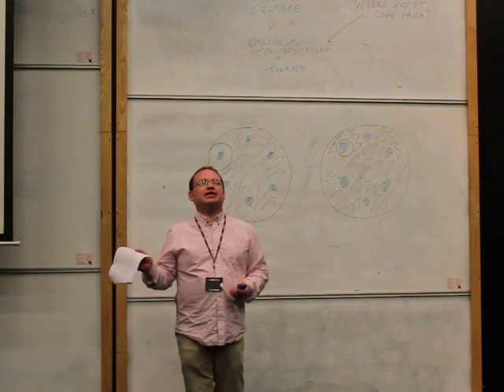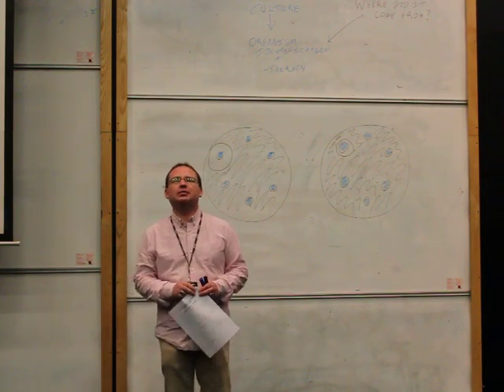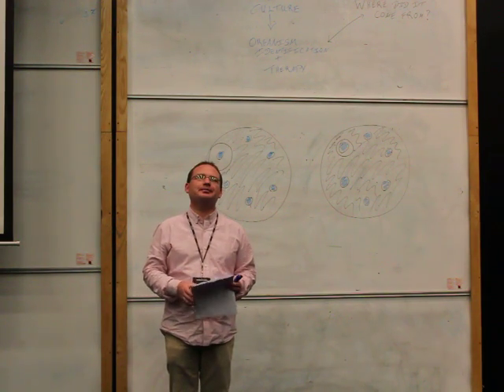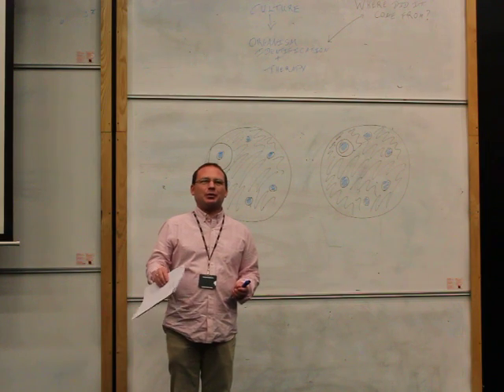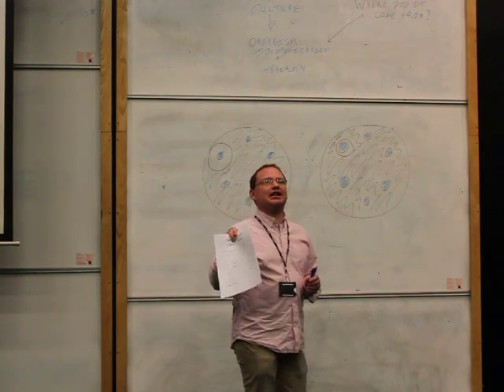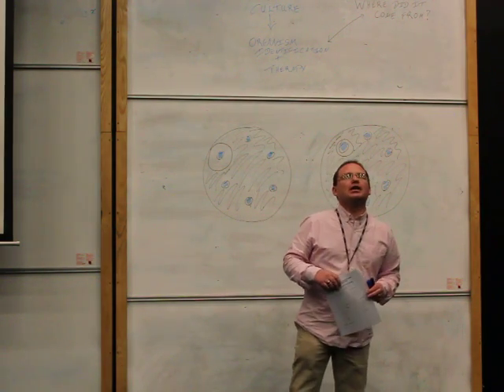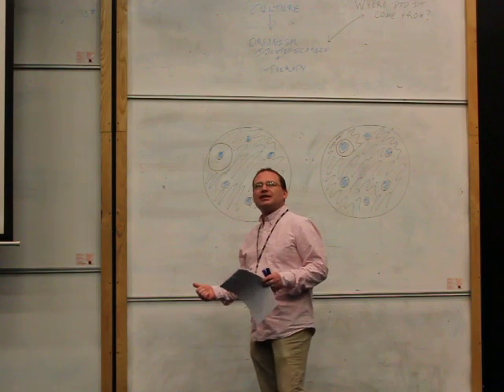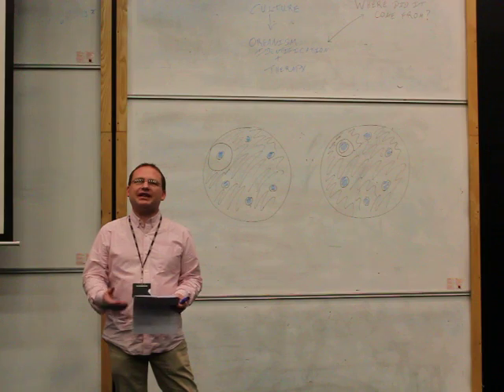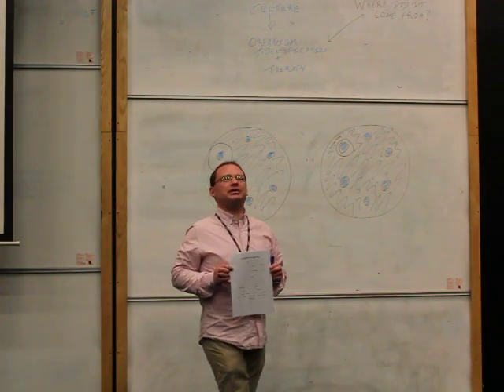First thing you will do is look at some Gram stains which we have put on the benches for you. They are prepared. All you have to do is look at them underneath the microscope. Sounds quite simple, as long as you know how to use a microscope. If there are any problems, please ask us. We will help you find these organisms. You need to record what its Gram stain is. Once you know whether it's a Gram-positive organism or a Gram-negative organism, then you will know which flowchart you will need to be looking at.